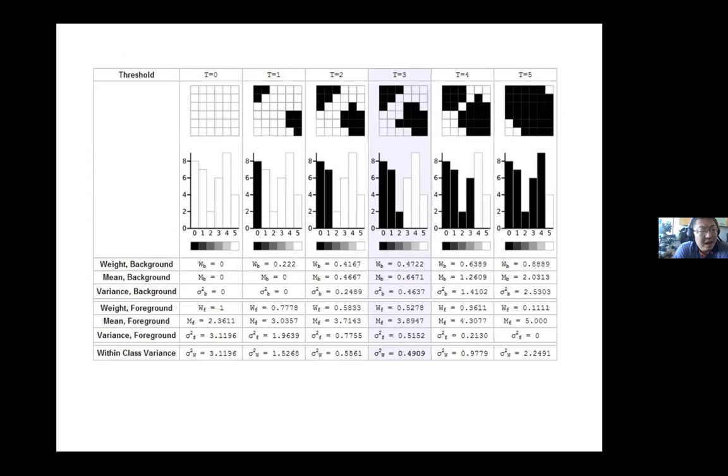For the other algorithms, they may use the same kind of way. They also may use a totally different way to calculate, but you can always find the original paper if you're interested in reading it. But I can just guarantee you probably won't like to read all these papers. And for us, it's very simple. Some people did this for us and provided this tool. All we need to do is check if this tool works for my sample. If it works for my sample, I would just use it.